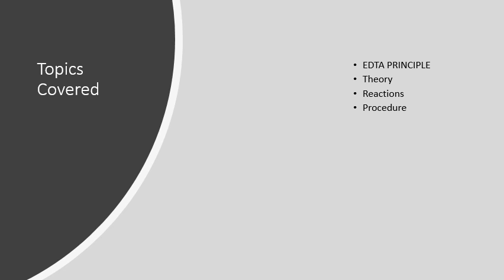In this lecture, we are going to learn the EDTA method. What's the principle of the method? The theory and the reactions involved in the method. What is the procedure of the method?